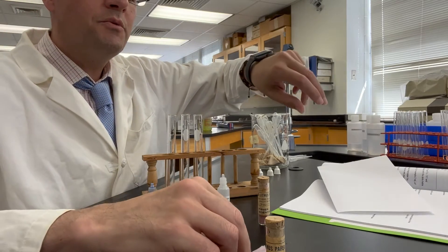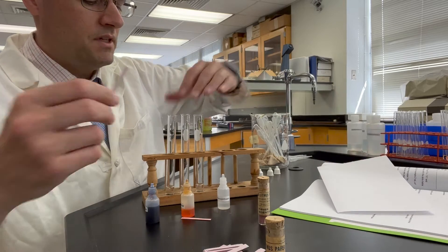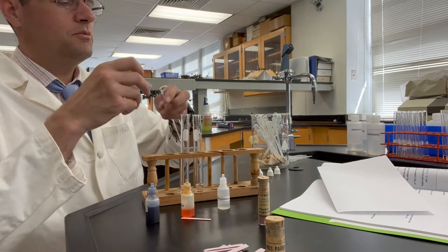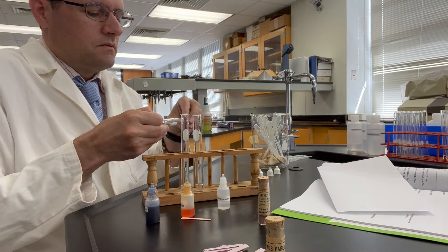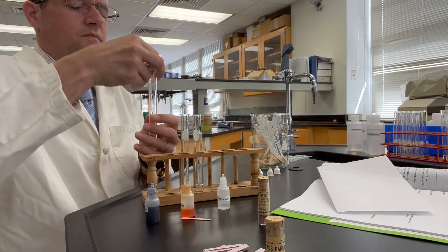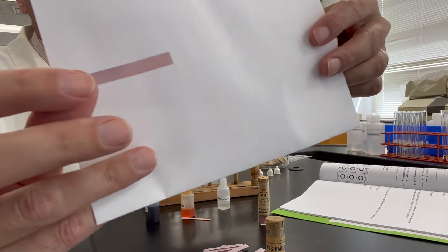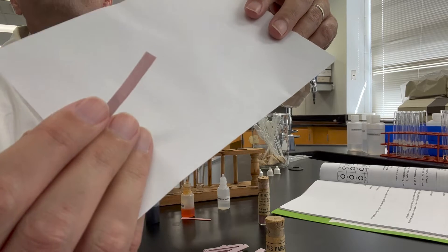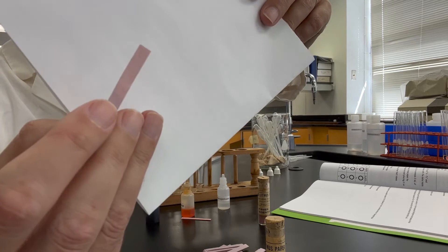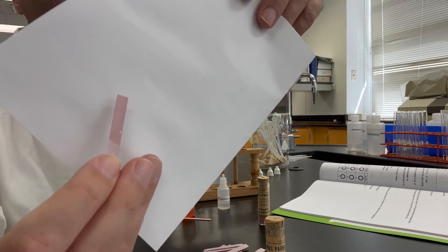Now the blue litmus paper — remember it starts out with that little bluish tint here. So we'll dip this into the ammonium chloride. Take a look. And that's the color there that results when it's placed into ammonium chloride.